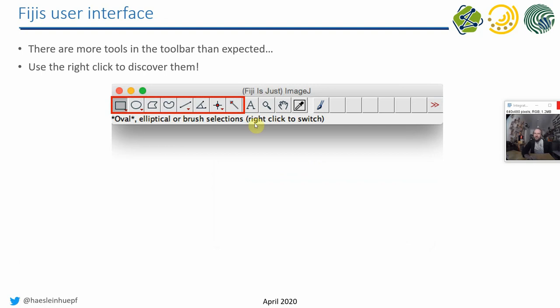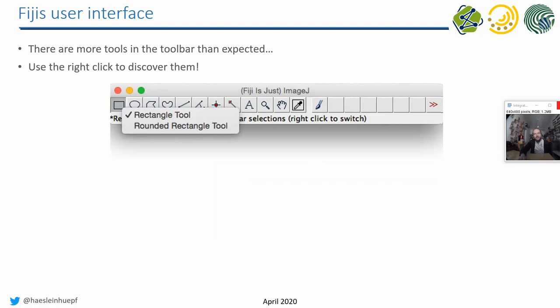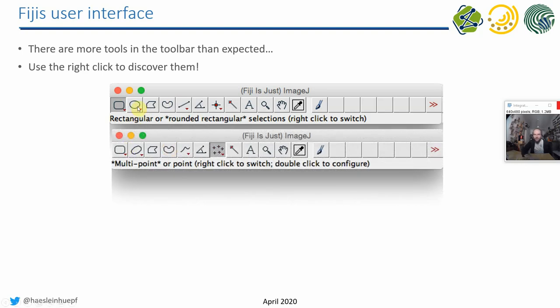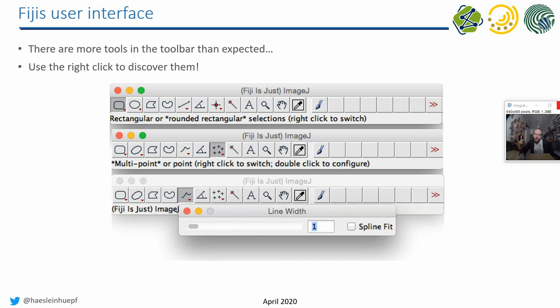The Fiji main window has many buttons — different annotation tools. You can draw a rectangle or a circle on regions in your image. Importantly, there is a right-click option on these buttons, which reveals additional tools. For example, you'll find ellipsoids, a single point selection tool, and a multiple point selection tool — useful for manually counting cells. You can also double-click on buttons to configure them in more detail. Buttons where you can do this are marked with a red triangle.